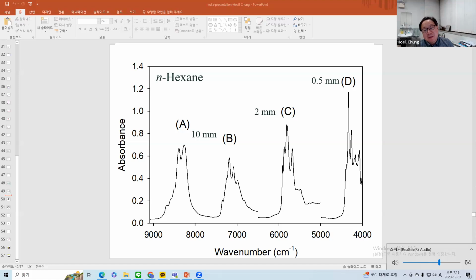I don't know. I mean, it depends on the application, I guess. But I would say lower noise, higher absorbance signal is better. I didn't check the other instruments. But if you go to the instrumentation company, they specify the RMS noise or signal to noise ratio in their specification. It also depends on which range you want to use. Maybe you might want to put a more sensitive detector in the target range. So there might be another way to improve the signal to noise ratio.